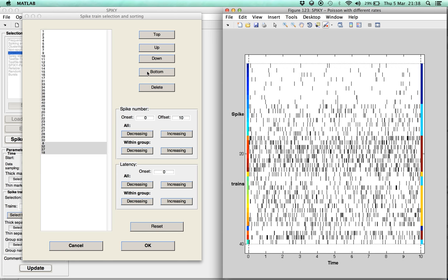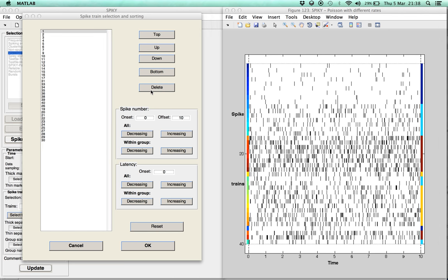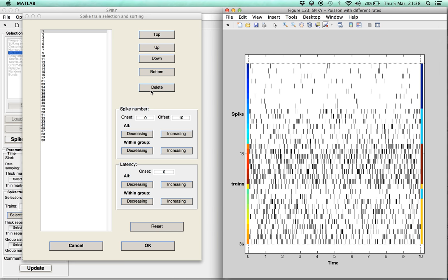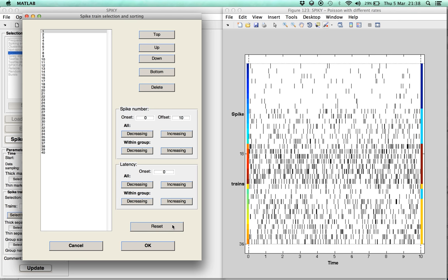Note that in case some of the spike trains are not useful at all, they can first be marked and then deleted. This was manual spike train sorting. Before we continue, we first reset the spike trains to their original number and order.